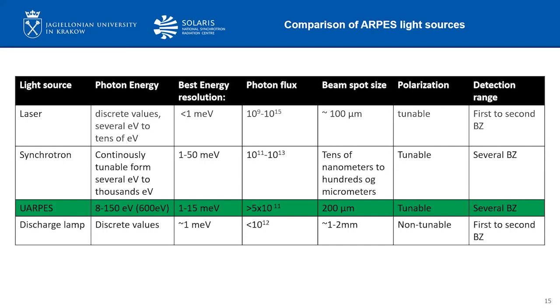In comparison to the other UV sources, discharge lamps are compact, and the beam position and intensity are stable. More importantly, the photon energy provided by a discharge lamp is suitable for typical ARPES experiments, owing to the reasonable photoemission cross section and negligible space charge effects.